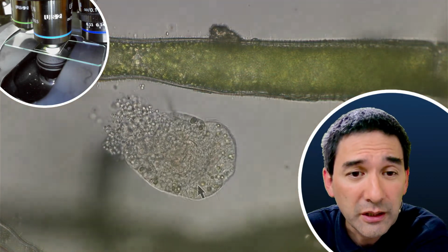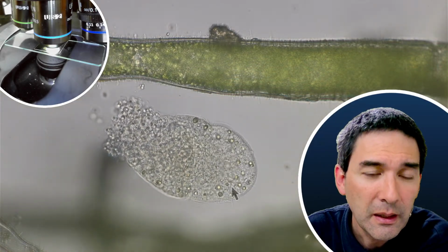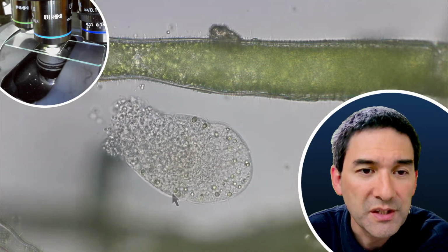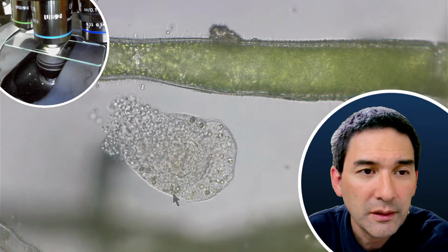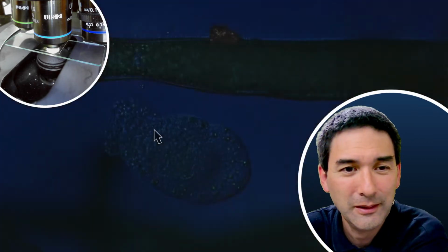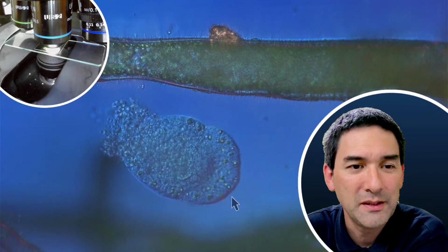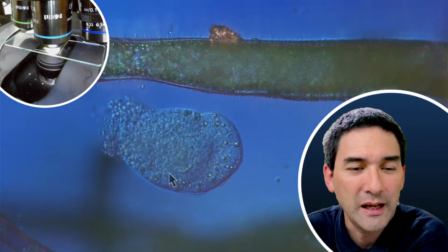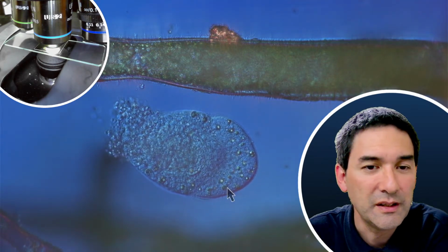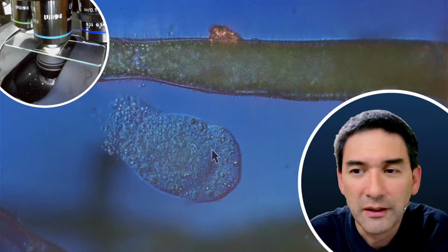we're able to see the color a little bit better. Here they're not quite as pigmented, but sometimes they're quite red. It also maybe depends a little bit on the species that we have. And this one is just the head of the worm, ripped off. So basically, I've torn it apart as I've taken the sample out. And actually, I've never seen it that nicely before, because they're difficult to observe otherwise since they move around so quickly.